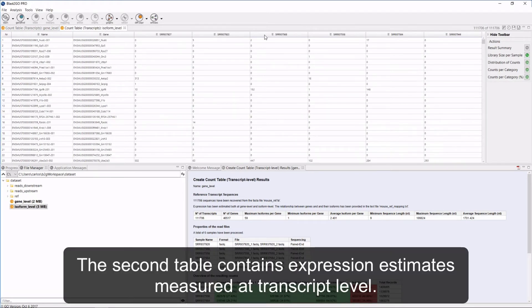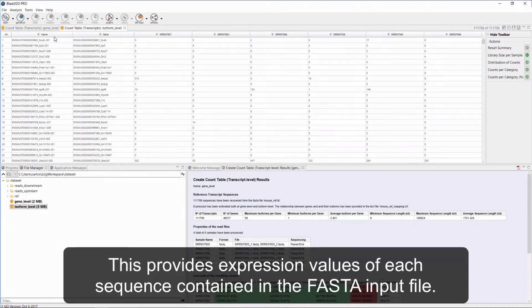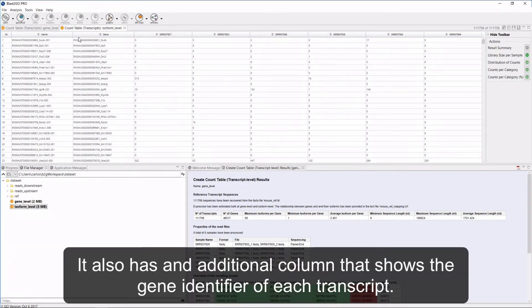The second table contains expression estimates measured at the transcript level. This provides expression values of each sequence contained in the FASTA input file. It also has an additional column that shows the gene identifier of each transcript.